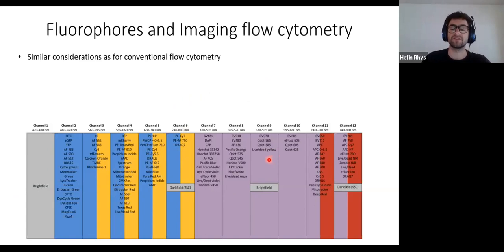So on most modern cytometers, we're spoilt in that each of our lasers is aligned to its own optical path, meaning that, for example, you could run BV785 because it's mainly excited by the violet laser, and APC Cy7, which is mainly excited by the red laser, in the same panel. But in the ImageStream, you're not able to do that because the violet and the red lasers are collinear. They're not distinct in space. And these 2 fluorophores have emission profiles that are too similar to each other.